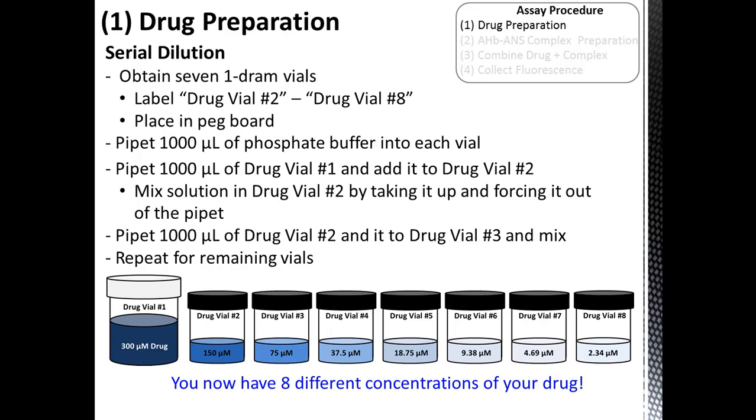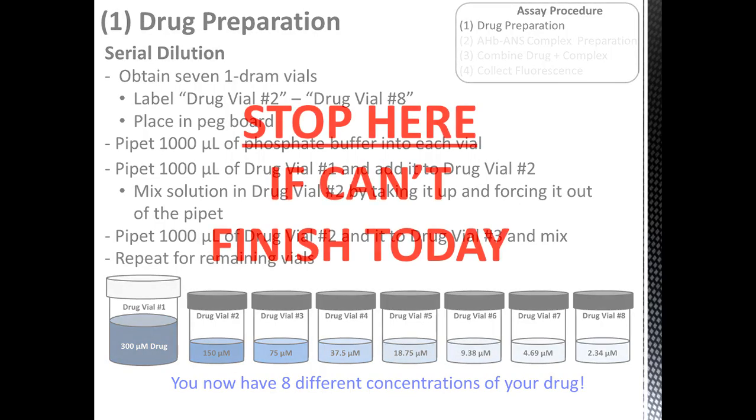Again, nice job. So importantly, you still need at least a half an hour to finish out the assay. And that's assuming that the fluorimeter is free and you can jump right on the instrument. So if you don't have a half an hour left in the lab period, I would just call it a day and pick up here next time.